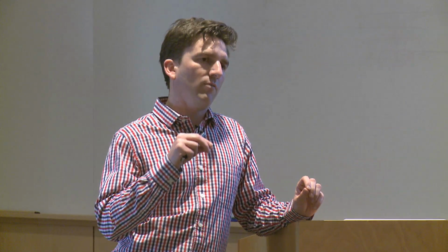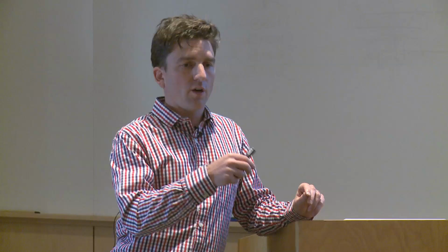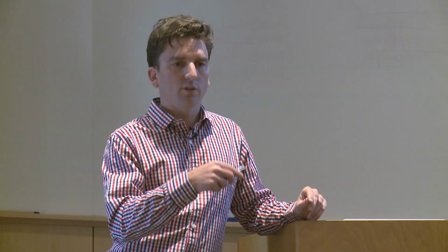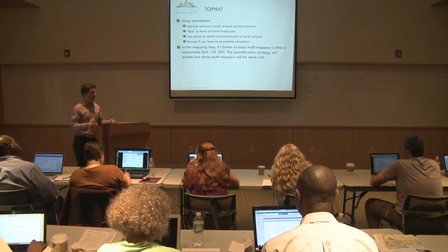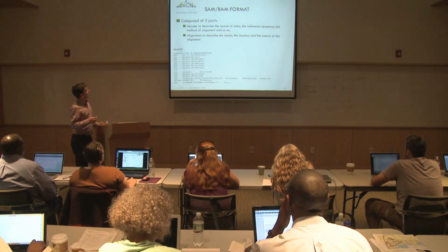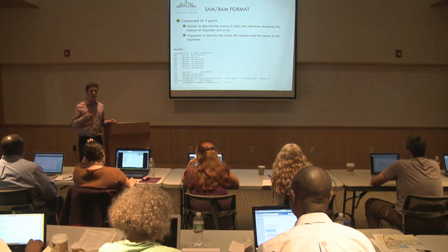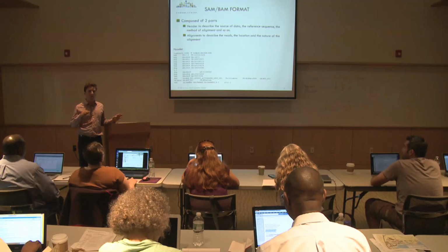You can say, give me all the reads up to 10 locations, or give me only the reads that map to less than 10 locations, and don't output the reads that map to more than 10 locations at all. So you have your choice. Yes, in TOPHAT, you have the choice.